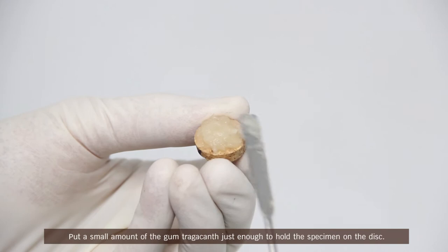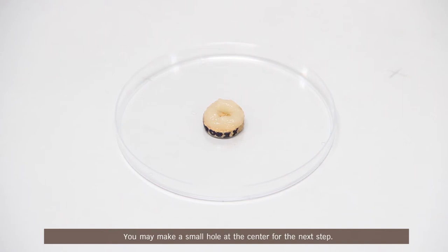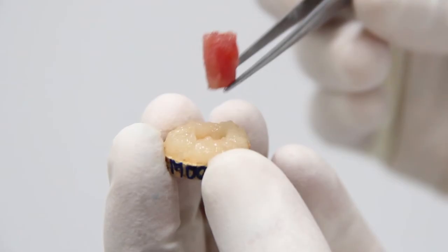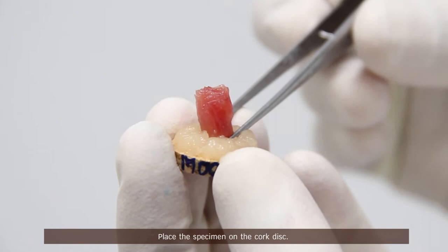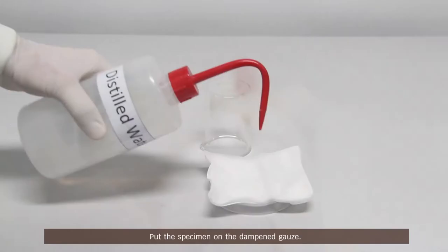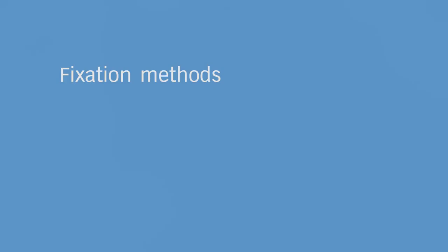Put a small amount of the gum tragacanth, just enough to hold the specimen on the disc. You may make a small hole at the center for the next step. Place the specimen on the cork disc. Cover the bottom of the specimen with gum tragacanth, so it will be held upright. Put the specimen on the dampened gauze. Cover it with a glass beaker to preserve moisture while preparing for freeze fixation.